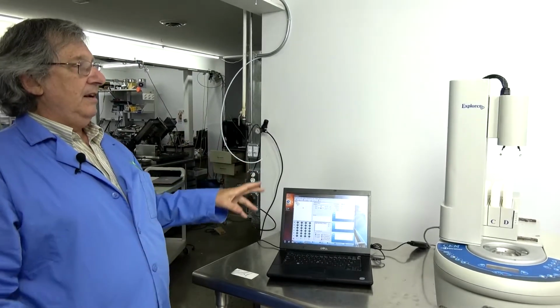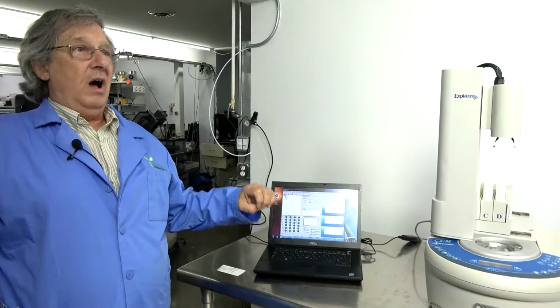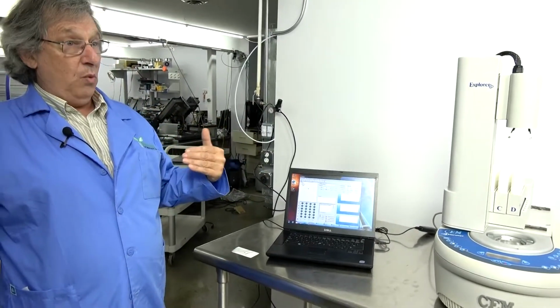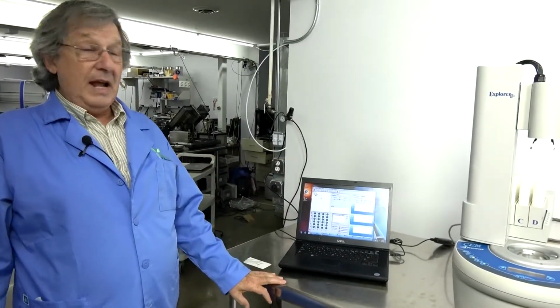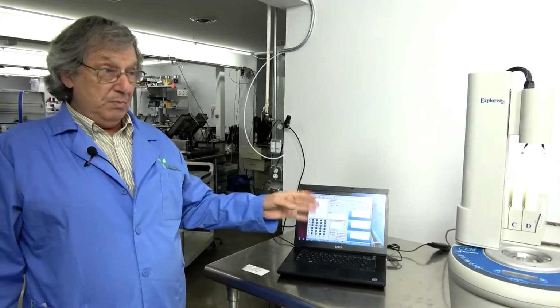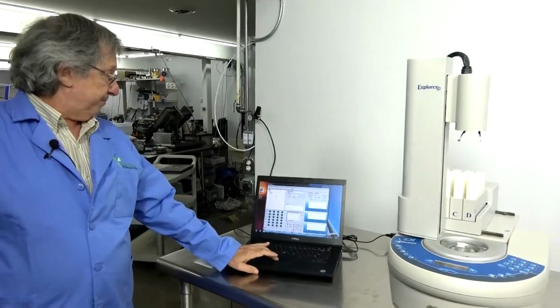We get these in, and sometimes we see a slow, jerky motion on them, or some of the motions don't work well at all. Biggest problem is lubrication. That's what we're talking about, how to keep these things running smooth. All the movements on it should be extremely smooth.